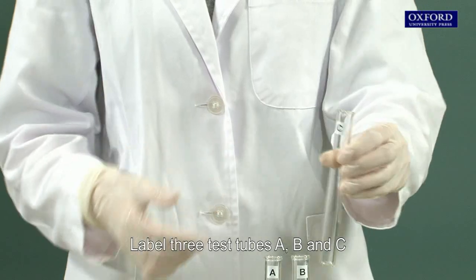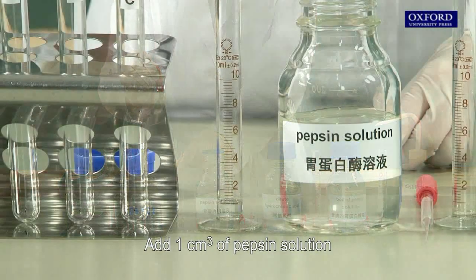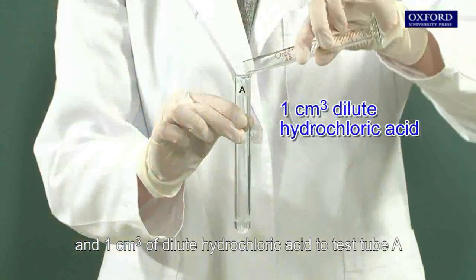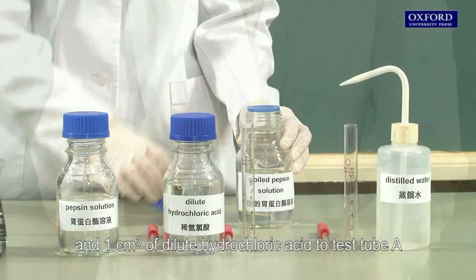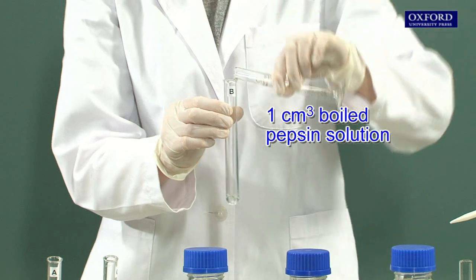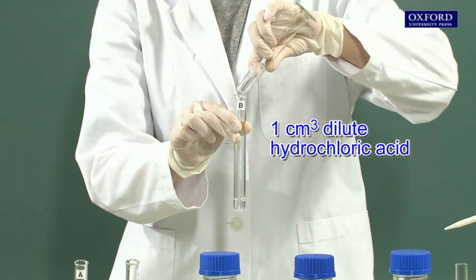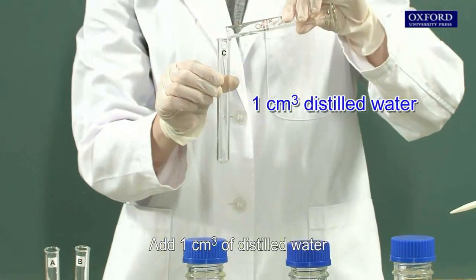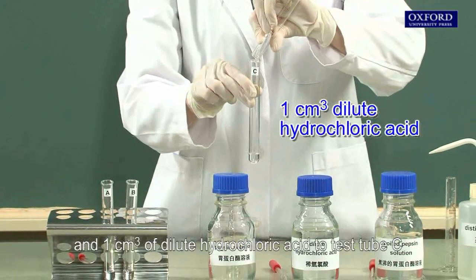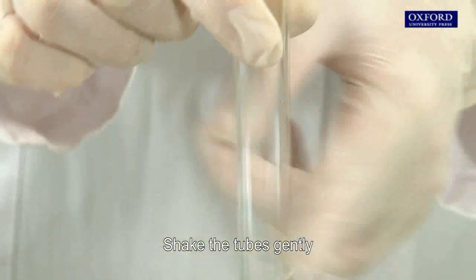Label three test tubes A, B, and C. Add one cubic centimeter of pepsin solution and one cubic centimeter of dilute hydrochloric acid to test tube A. Add one cubic centimeter of boiled pepsin solution and one cubic centimeter of dilute hydrochloric acid to test tube B. Add one cubic centimeter of distilled water and one cubic centimeter of dilute hydrochloric acid to test tube C. Shake the tubes gently.